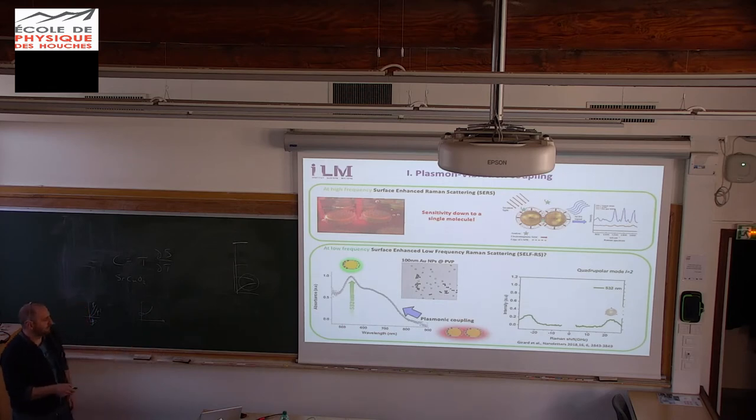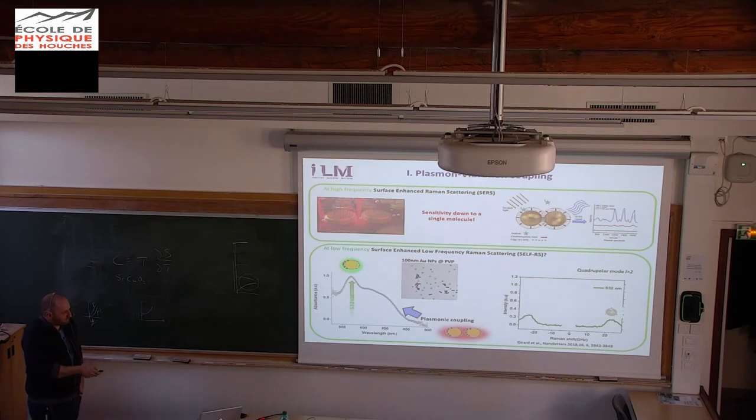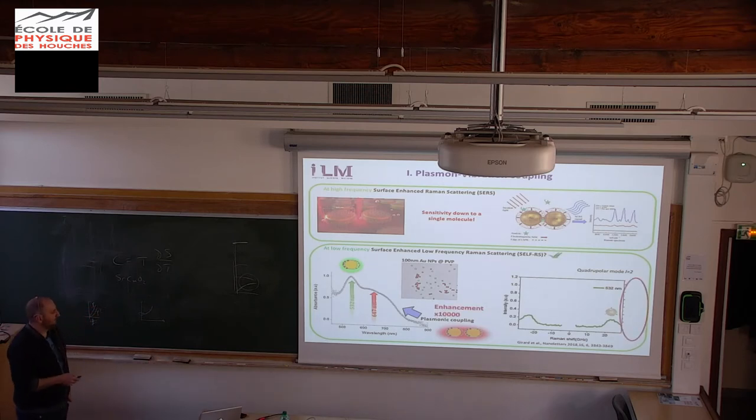So historically, the people were always exciting at 532 in resonance with a single nanoparticle. And in this work, we obtained this spectra. So this is a quadrupolar vibration mode of this 100 nanometers nanoparticle. So here it's one wave number, for people who ask. And we said, why not? We have another plasmon, so let's excite this other plasmon, so probably these structures, we are not sure of that.